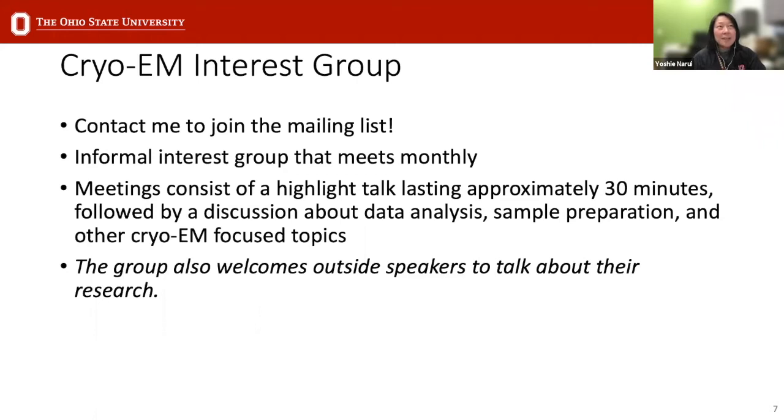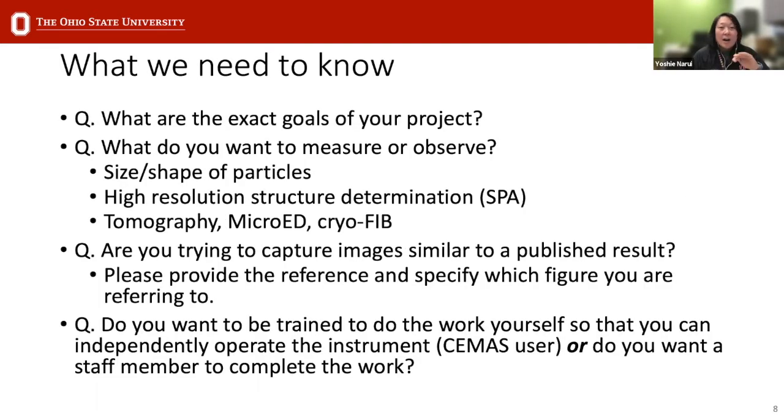Okay, so mainly what I'll be addressing are questions related to, I would say, single particle analysis, but if you have more specific questions about working with cells or tissues or things like that, you'll probably have to contact us. But I wanted to outline what you should tell us when you contact us. So what do we as instrument managers need to know about your project? I would say the first thing is you need to tell us, what are the primary goals of your research project and how can we help you achieve those goals?